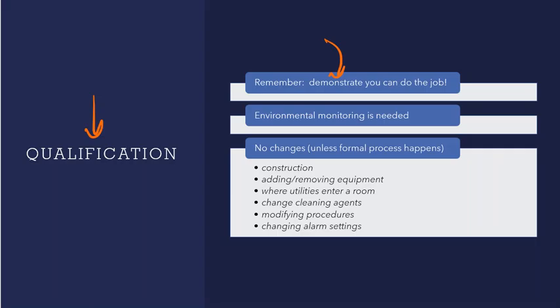So they're pulling air samples through and they're analyzing these air samples and they're telling us particulate count. We've got these petri dishes that we can put on these air pulls to see if any kind of microbial growth begins to happen. So again, environmental monitoring. Those are just two examples of the monitoring that we're supposed to be doing. They're going to want to see those. They're going to see the reports of those, the results of those, and so forth.